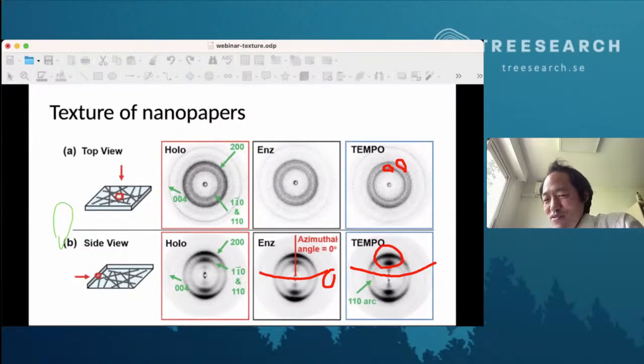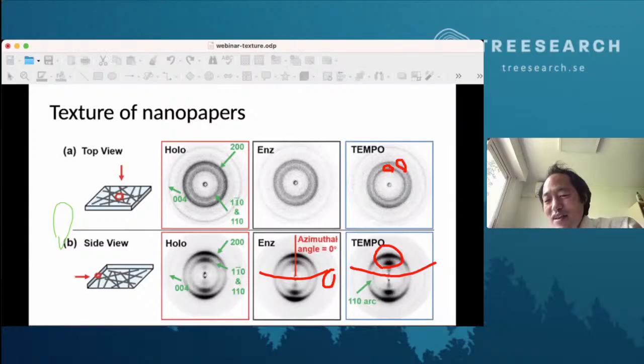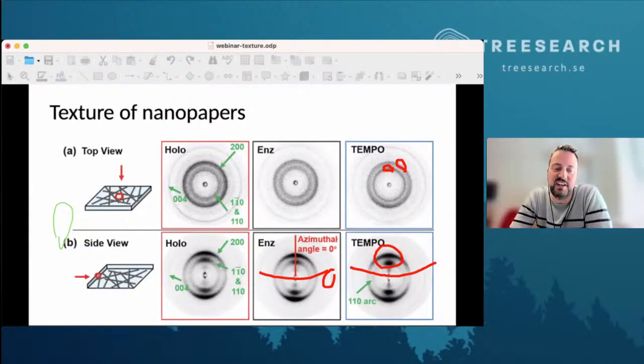As long as you scale everything in absolute terms, if you have the measurement of the transmission X-ray, then the intensity you directly measure is proportional to the quantity you have. So you can have the mass of water in the beam directly. My question is basically, do you dare to say that you don't have any water left, or is it more on a relative scale, that you have little or much water? When it's dry, can you use X-ray to say that it's absolute?